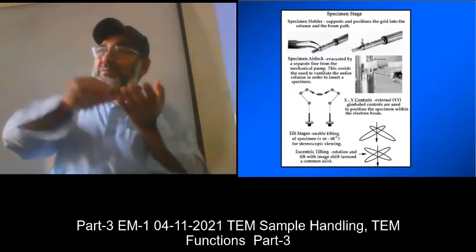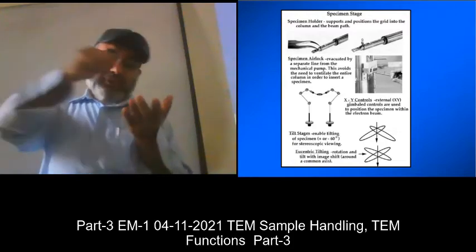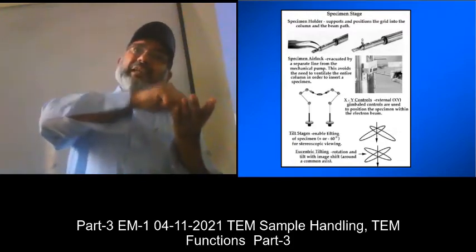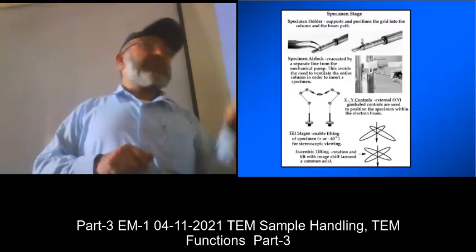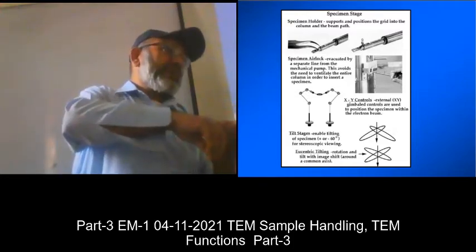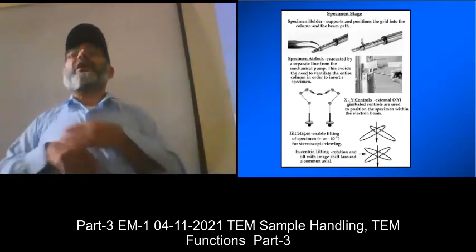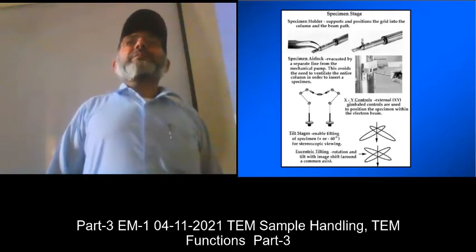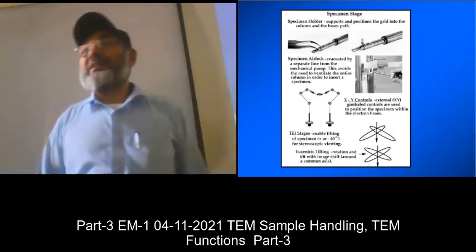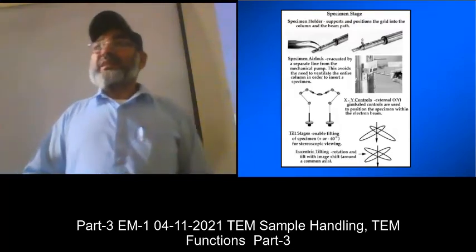So the sample comes with the vacuum tweezer. You put the sample in the proper place, and when you release that knob, that hole, then the sample is dropped there. So that is the safe way. But this never means all the people doing microscopy are breaking their sample. But extra care is always needed.